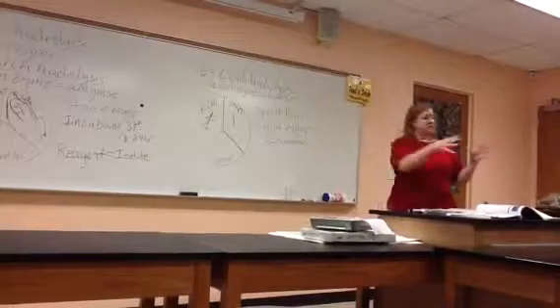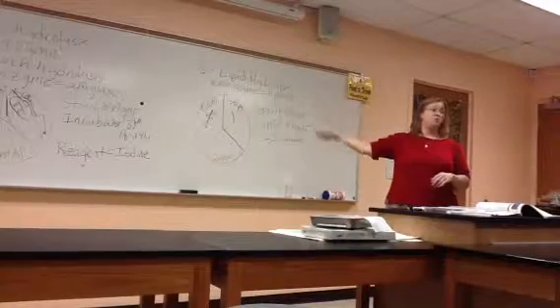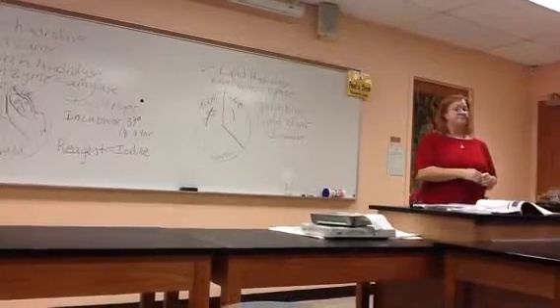You're working in your groups, right? So, half of the table you've been working with, and you just need to do one starch plate and one lipid plate per group. Question?